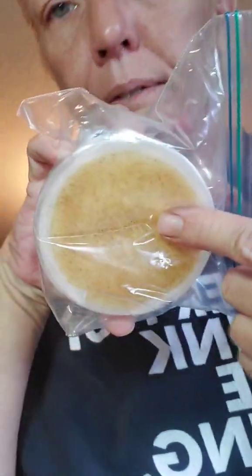So we're going to be working on this. I'm going to put these guys back in the bag so we don't run the risk that they get jacked up. And the one thing that I will say, I wish I had a contaminated plate so I could show you. If you see any other color other than what you put in this plate, mycelium and agar, throw it away.